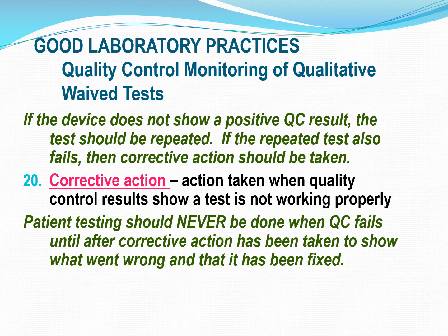So if the device does not show a positive QC result, the test should be repeated. If the repeated test also fails, then corrective action should be taken. Okay, what is corrective action? It's action taken when quality control results show a test is not working properly.